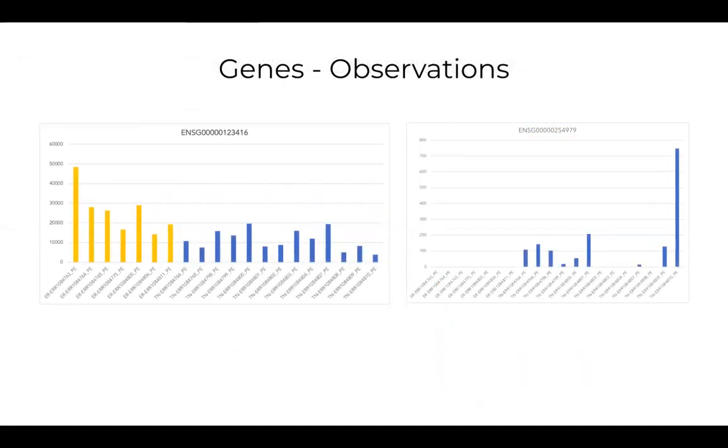Genes and observations. Differentially expressed genes are the ones we can identify to have clear differences in expression level between two groups. Here, you can see one gene is highly expressed in the ER condition, and that gene in the second image has no expression in another sample.